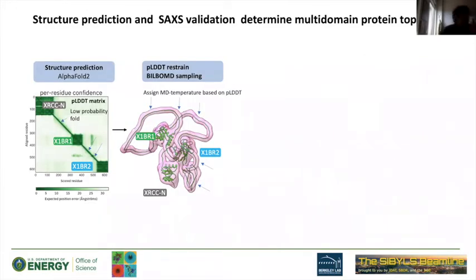And before that, I think this is the last slide about modeling. I know I'm going back and forth, but again, to model structures in solution state, I think SEC-SAXS really allows you to believe in your data and push the limits, for example with AlphaFold. AlphaFold has a good sense for fold, but unfortunately the overall topology for multimodular structures is lacking.